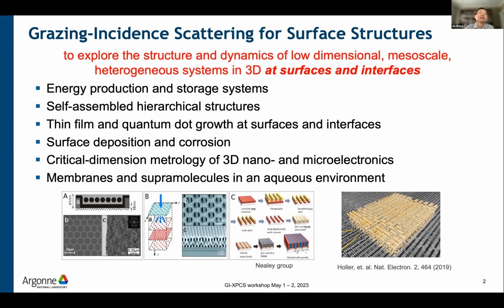Recognizing the power of this method, we've been using grazing incident small angle scattering and wide angle scattering to study surface structures, like in energy production systems, and a lot of systems with self-assembly, thin film quantum dots, and all these things happening at the surface and the interfaces.